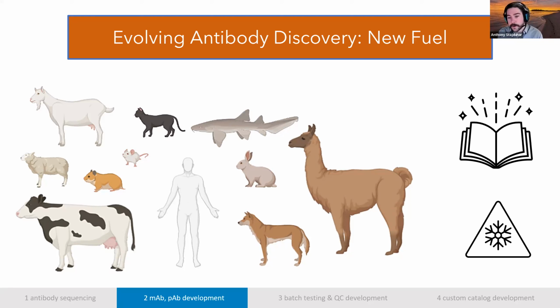you're hanging on to the last little bit of this monoclonal antibody you like to work with. We've been able to recover and sequence many of those types of antibodies, but as I said as well, a lot of people just have a lot of polyclonals that they developed over the many years, and they've been saving them for quite a long time, again, for similar points of interest.